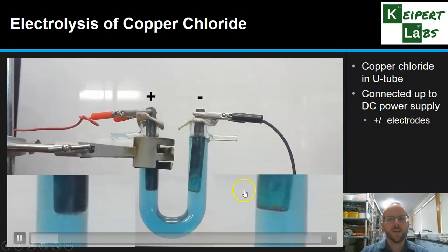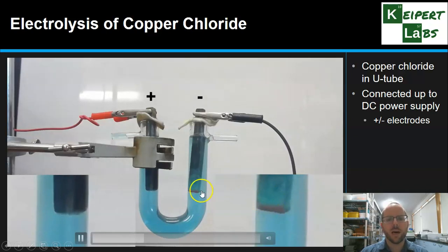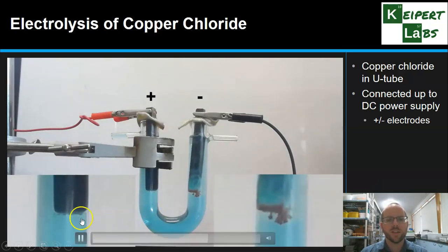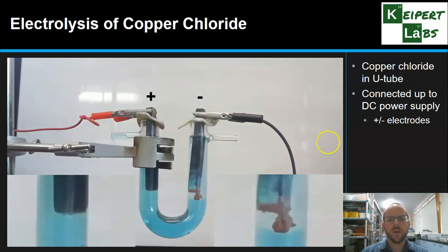Okay, so we've got a bit of a zoomed-in image here. You can see we've got some bubbles forming at the base of this electrode, and we're starting to see a reddish colour forming at the bottom of this carbon electrode on this side, the negatively charged electrode side. You can see this reddish colour, it's a deposit that's starting to grow in size, bigger and bigger as time goes on. So this is representing about 30 to 40 minutes of real time. We're seeing some more significant bubbles of gas forming over on this side that are then escaping through the top of the tube out here, and that deposit continues to grow larger and larger over the time. And there we are.